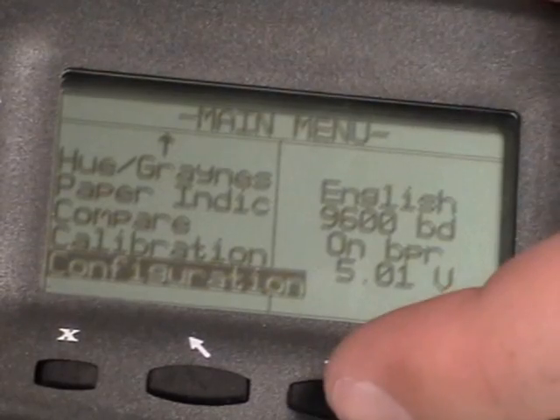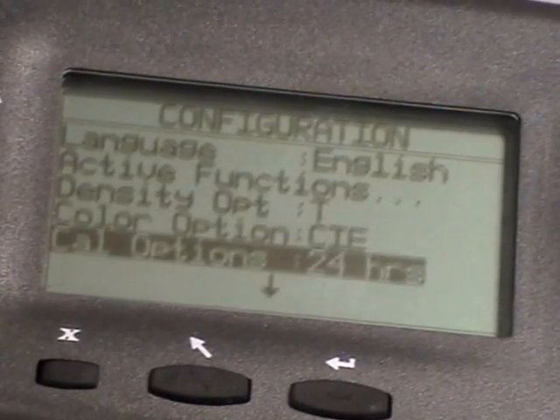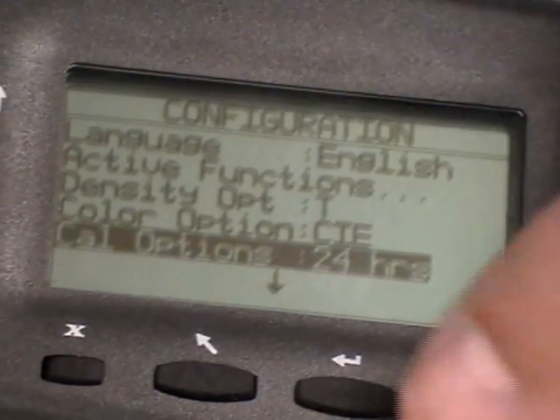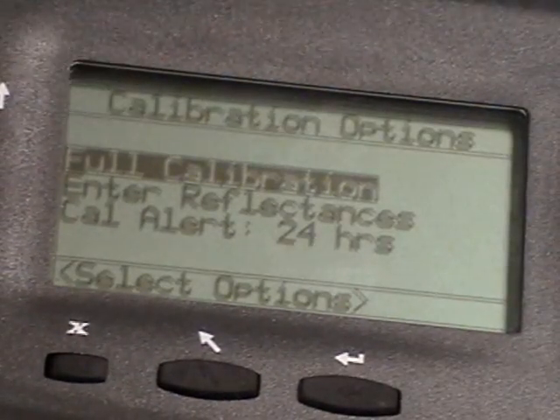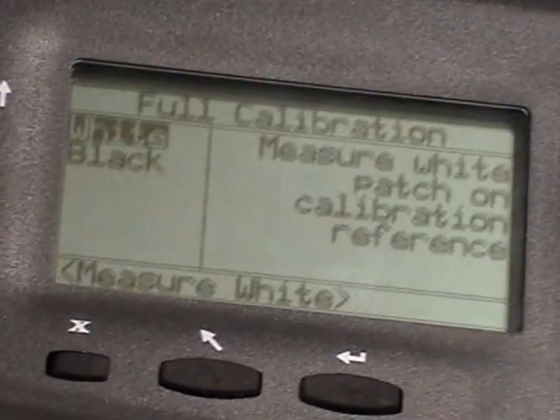Once at Configuration, you press the Enter key, getting inside, scrolling down again until you see Cal options. Press Enter again. You'll see the display of the first one — full calibration. Pressing Enter will get you into the full calibration.